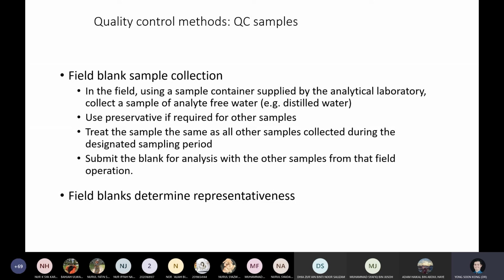If you do that, you can possibly pick up any factors that might introduce contaminants into your sample water. Now, you don't know the concentration in your sample water, because it is unknown. But in distilled water, it is quite safe to say nothing should be inside there.